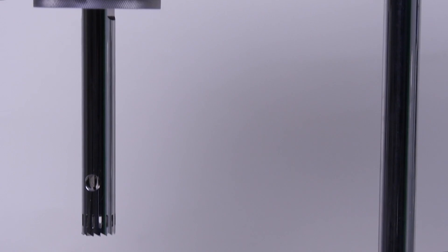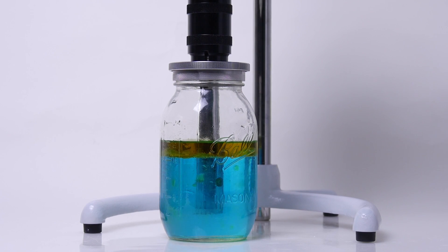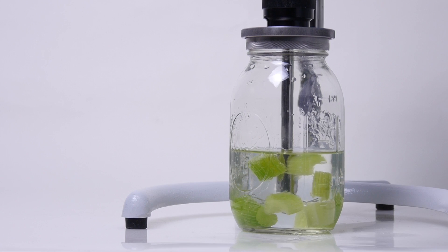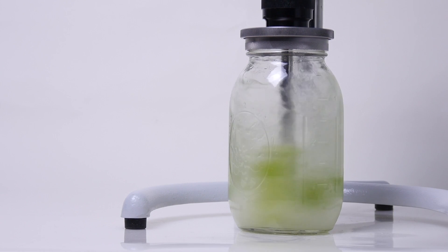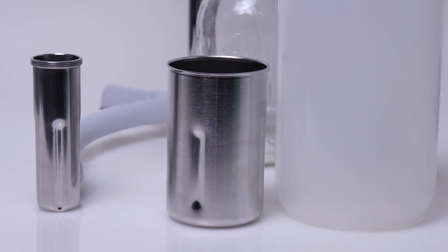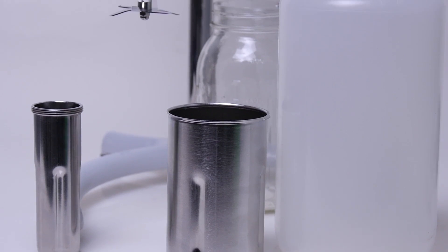Rotor stator generator probes can be used for vigorous sample disruption for open vessel processing or can be interchanged with blades inside the same sealed glass, plastic, or stainless steel jars.